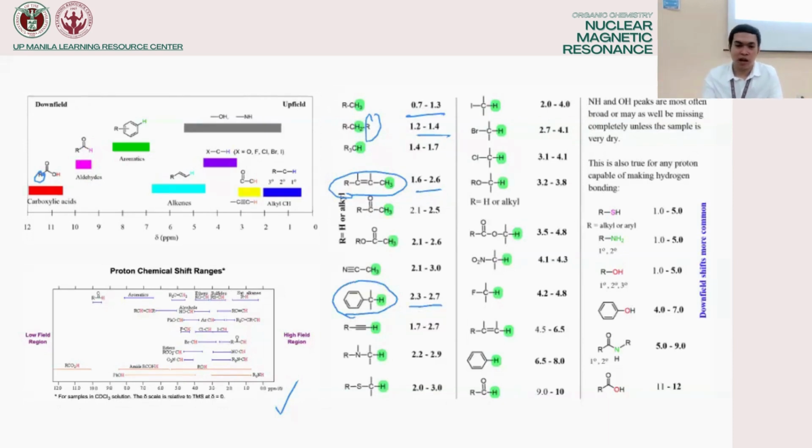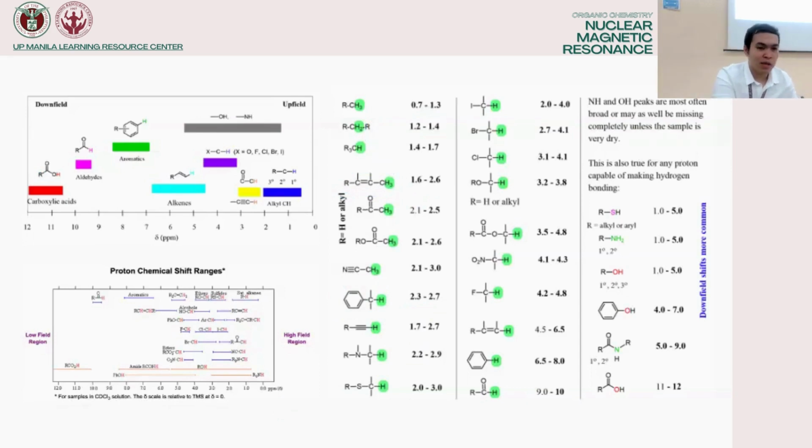As you add more length or as you add more electronegative groups, more benzene ring, mas nagiging deshielded yung ating nucleus. Okay? Kapag maraming kinukuha sa'yo, di ba, maraming pupunta sa'yo, ano ba ang target ng mga maraming pumupunta sa'yo na kumukuha ng electrons mo? So, ibig sabihin, mas deshielded ka.